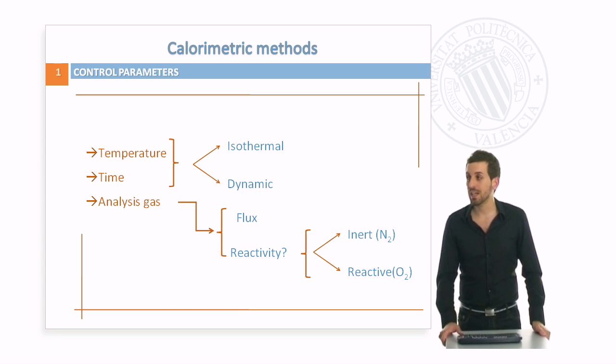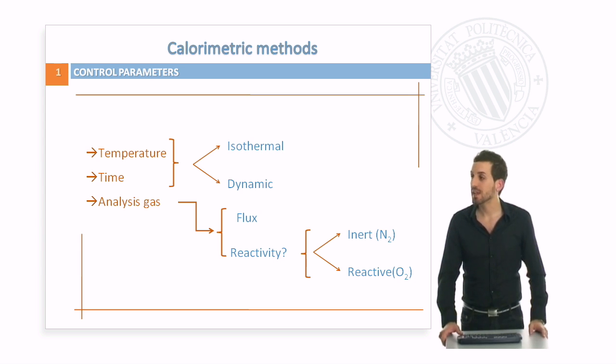The main parameters are temperature, time and gas of analysis. By the combination of the first two, the temperature and the time, we will apply some different segments, isothermal or dynamic, as we will see.